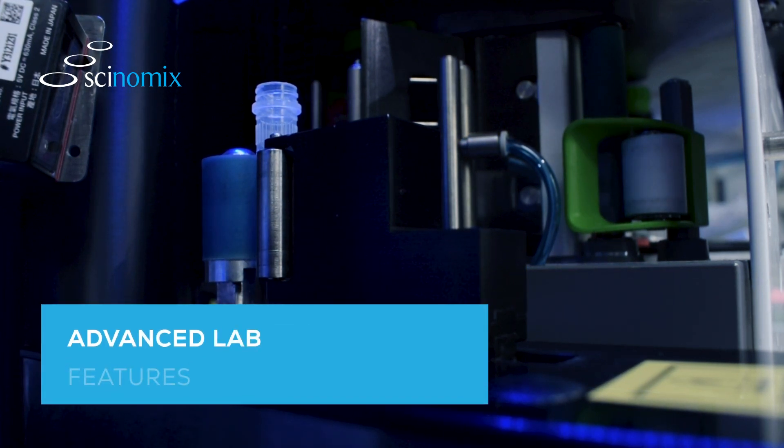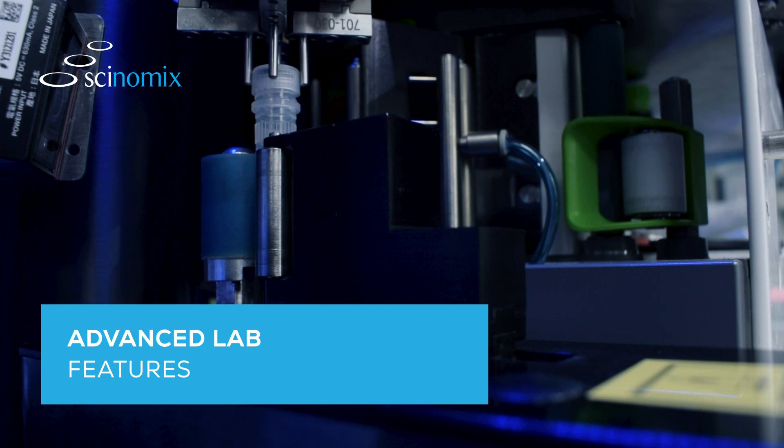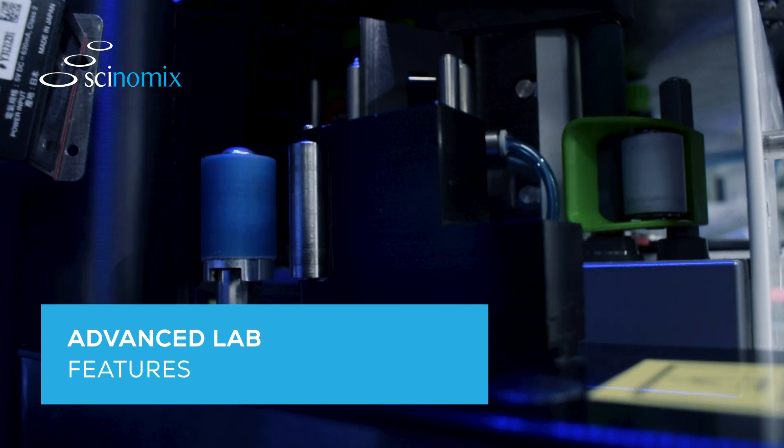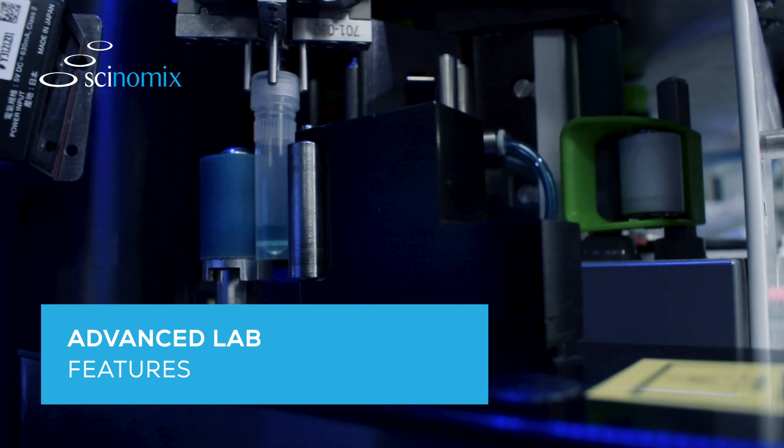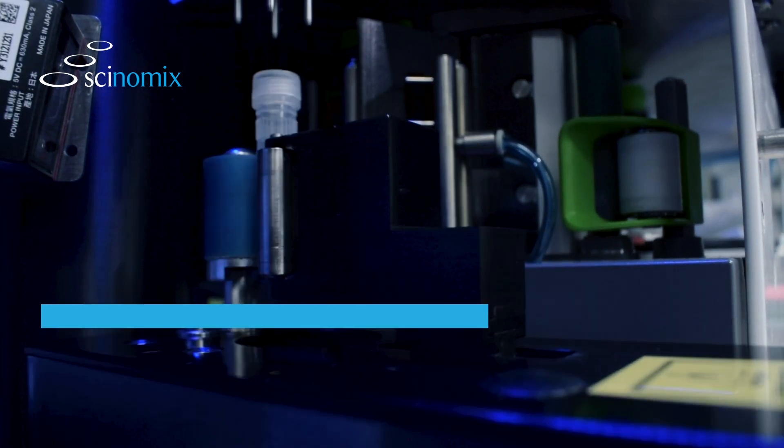With its advanced features for precision pipetting, weighing, validation, tube labeling, and more, this system will make your lab operate more efficiently, ensuring accuracy every step of the way.